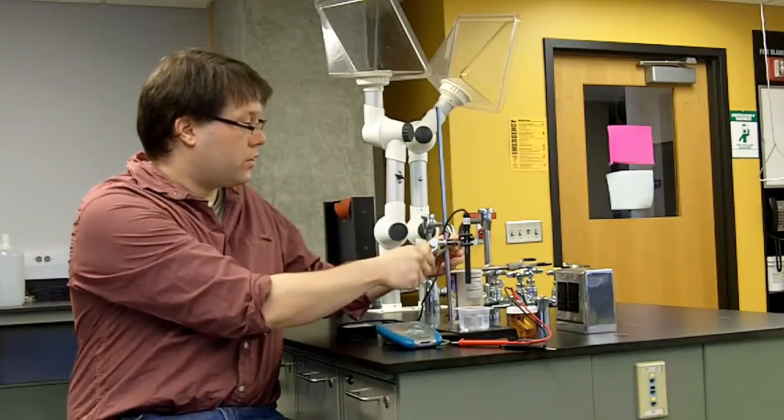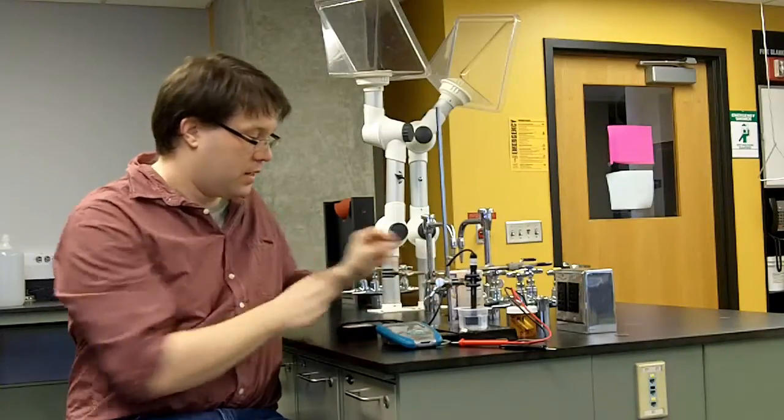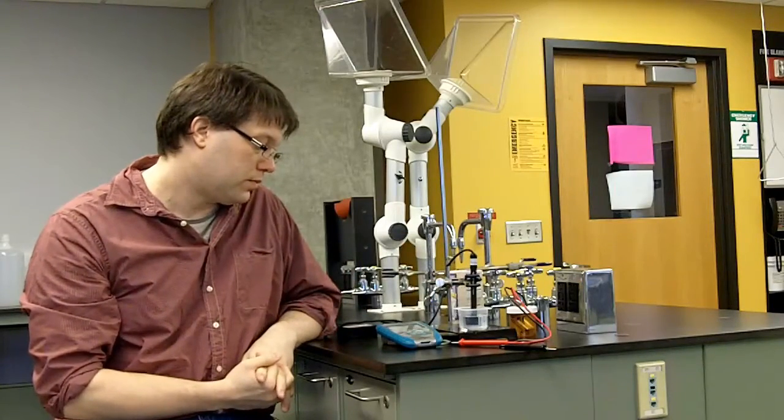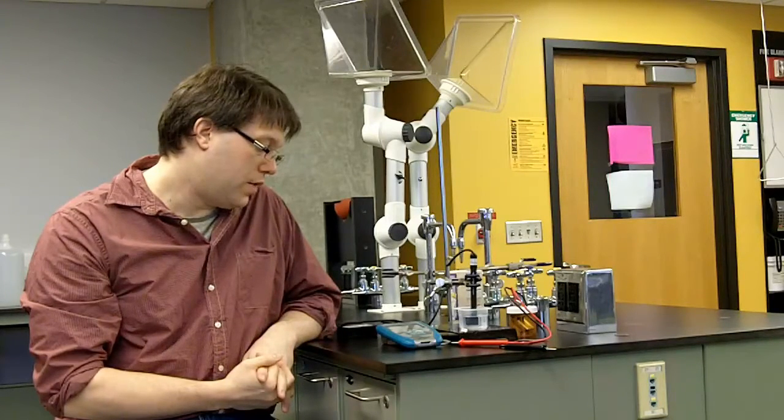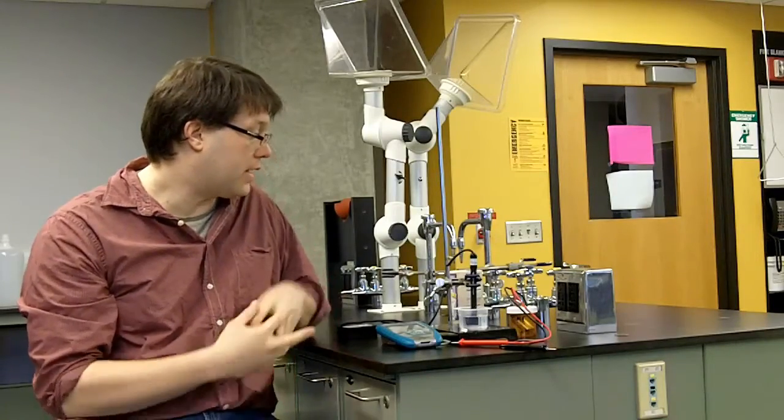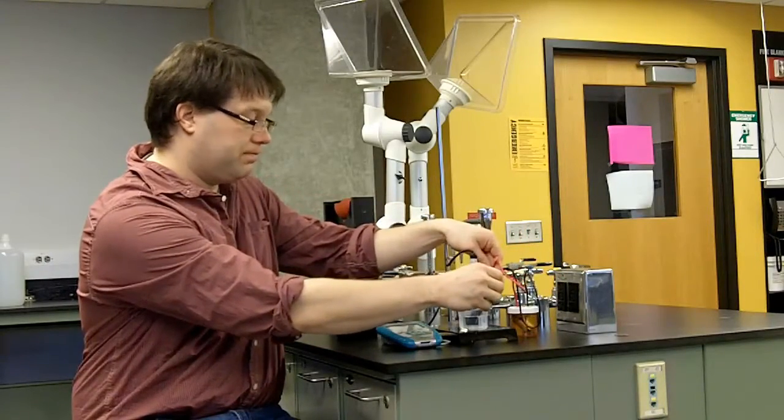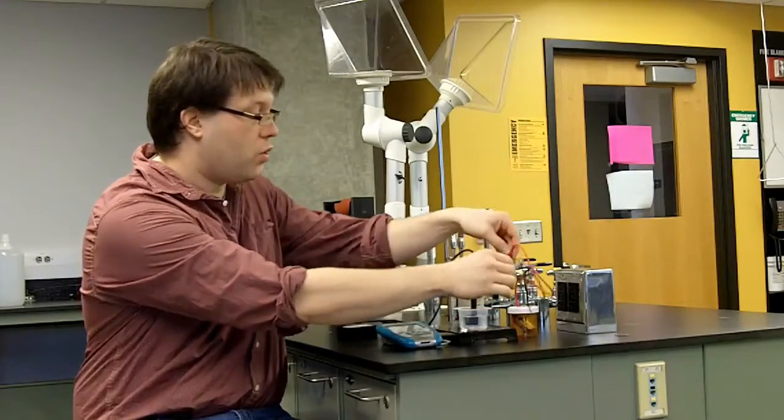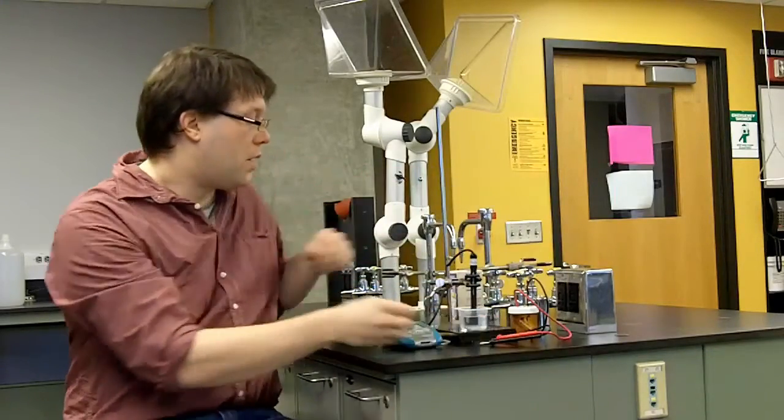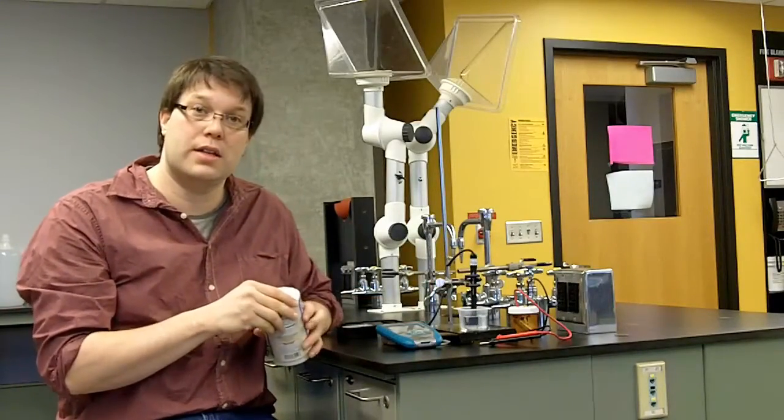So to test it first we will put the digital probe into it and see what it says. And it is reading about 6 µS per centimeter. So not very high conductivity at all. And if we place the LED probe in it, it does not light up at all. So this water is non-conductive and that is because the ions have been removed from it. You need to have ions in your water so that it is conductive.